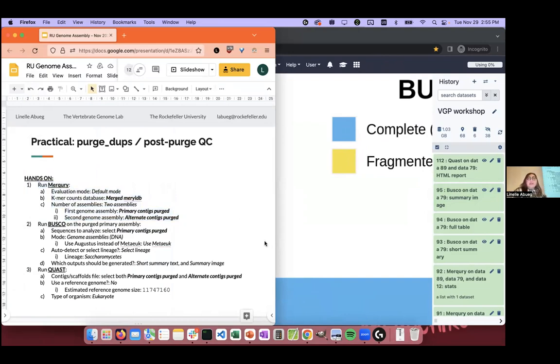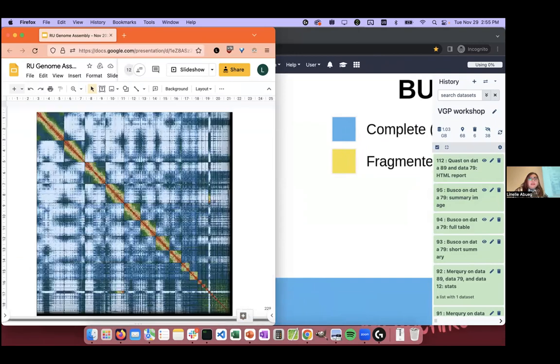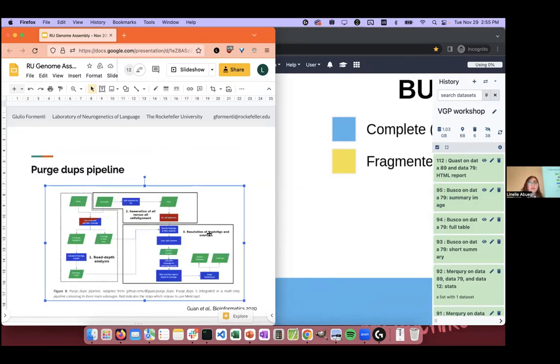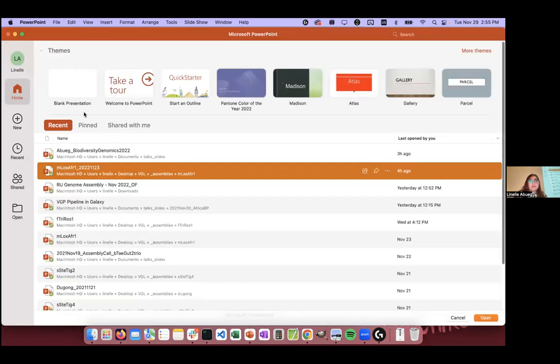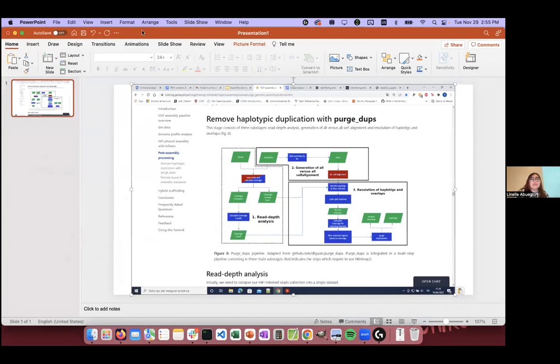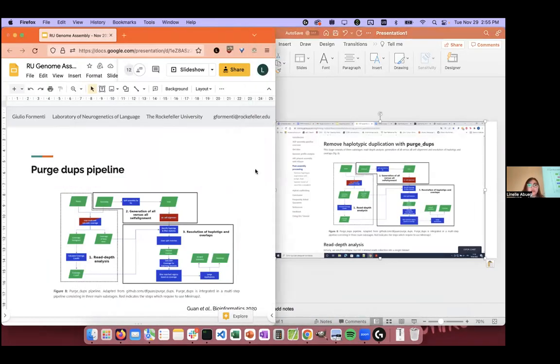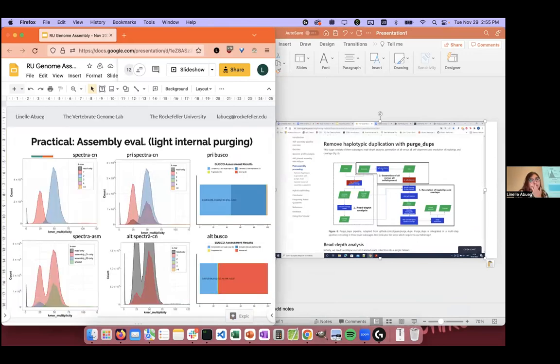Oh, sure. Yeah. Okay. It might be better if I have the image beside it. Let me copy this to something. We'll just throw this into PowerPoint and then put it on the side and zoom in so that I can show it alongside the steps.